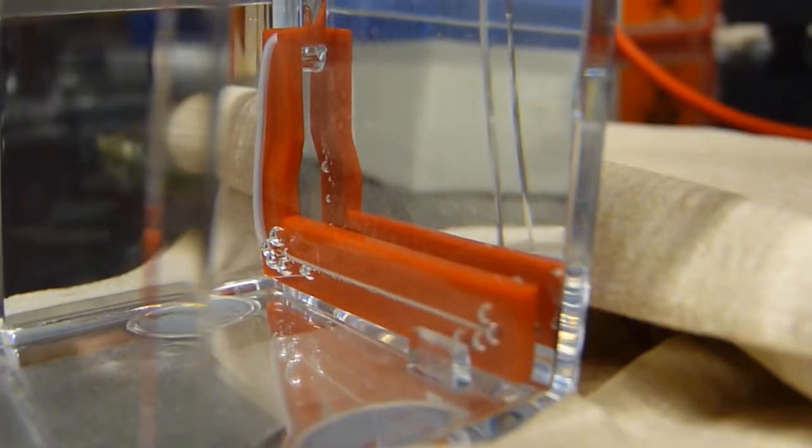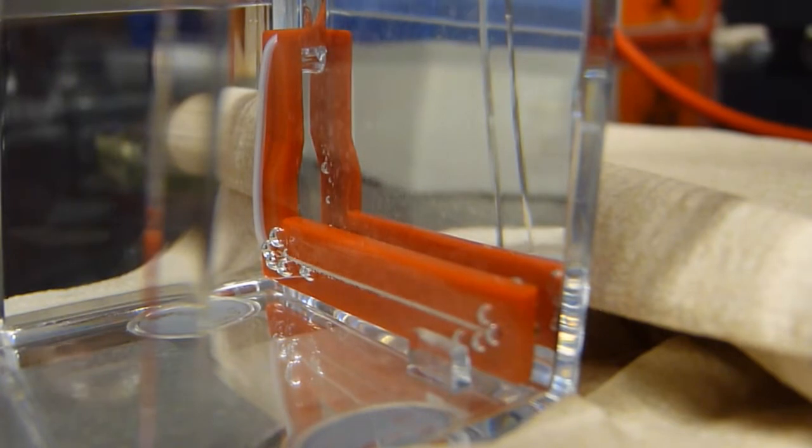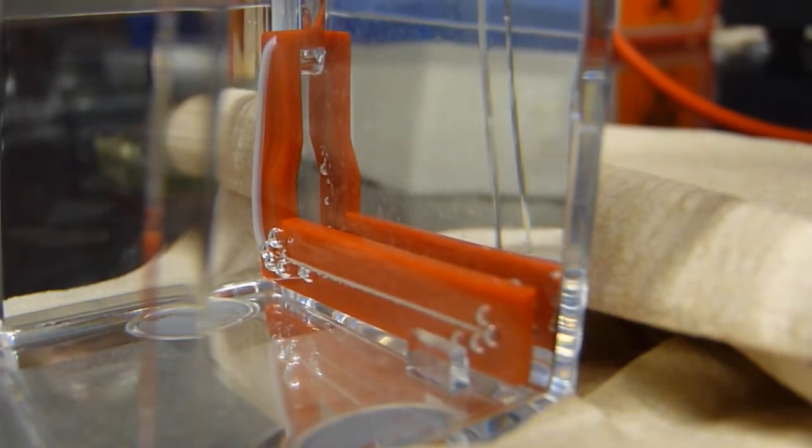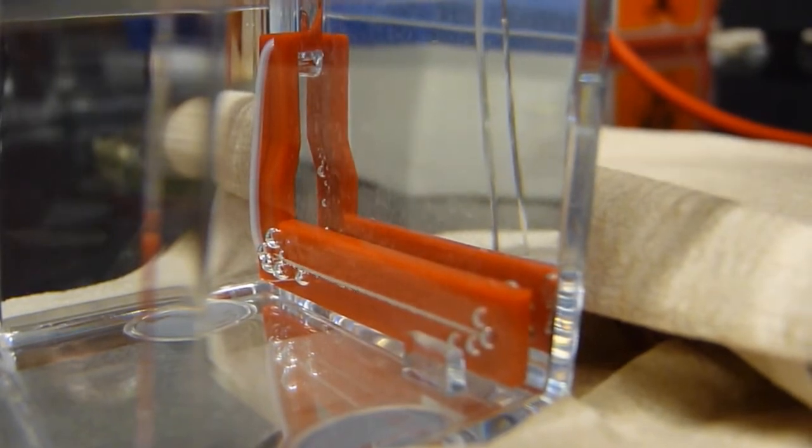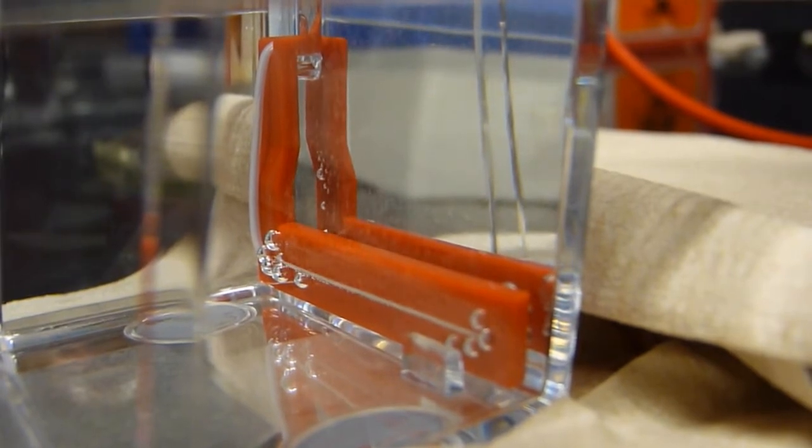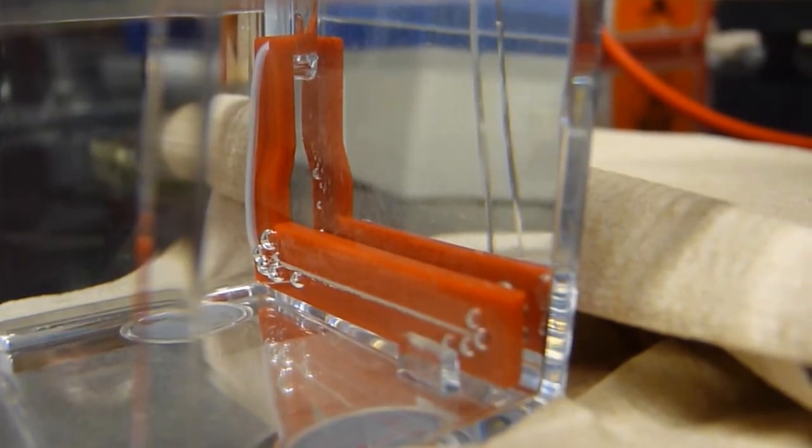So now we're running our gel. You'll know that the gel is running because you'll see bubbles forming on the ends of the tank. The gel run will take approximately 40 minutes, but you can also know when your gel is done because you'll see the dye that you loaded into your sample wells migrate about three-fourths of the way into the gel.